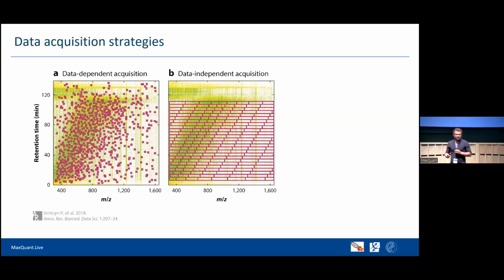There's also DIA. It's the same cycle idea. You start with an MS1 scan, but you don't pick specific precursors. You select certain ranges and fragment bigger mass ranges. This is indicated here. So there are wider ranges selected. So you have several peptide species in one isolation window. You get more complex MS2 spectra, and you have to use different algorithms to analyze them. This brings many advantages. It always depends on what you want to do. Sometimes it doesn't, but often it does.